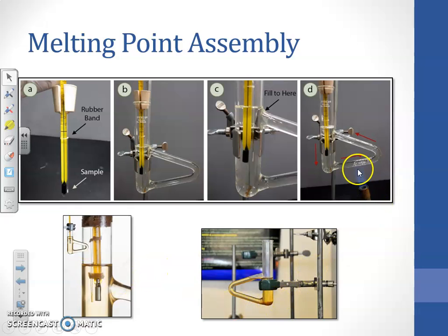And then after heating we have to continuously observe the temperature on the thermometer and whether the substance has melted or not, and we have to note the temperature at which the substance melts and converts into liquid. That can be visualized, and that is our observation.